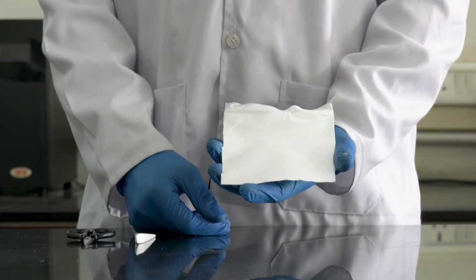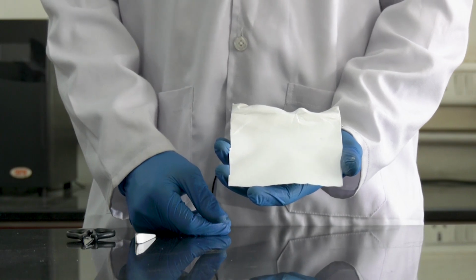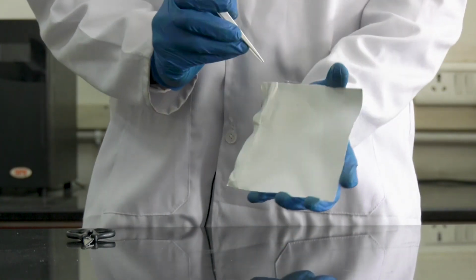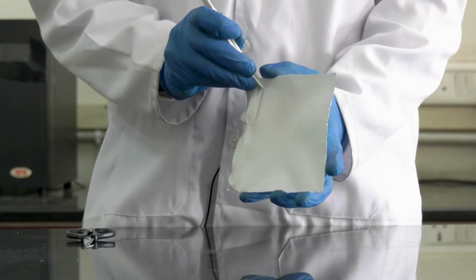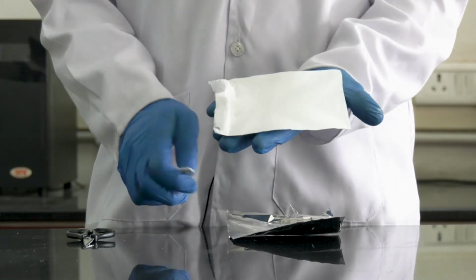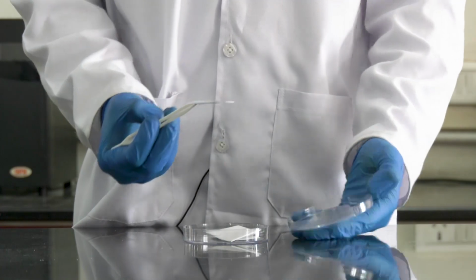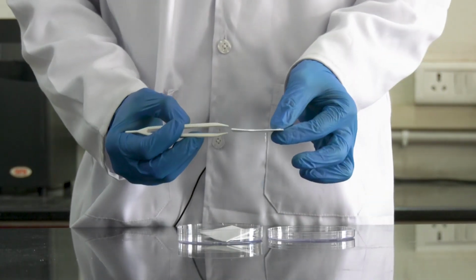This is the final output of the fabricated nanofibers from the electrospinning machine. Now we will peel the nanofibers from the collector using forceps and then cut them into pieces according to our requirement. Here you can observe the side view of the nanofibers to examine their thickness.